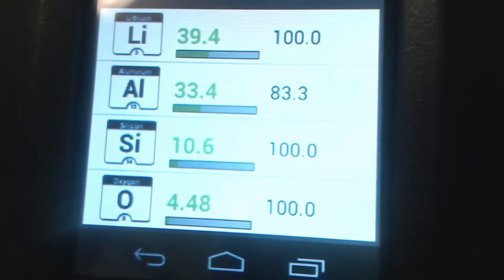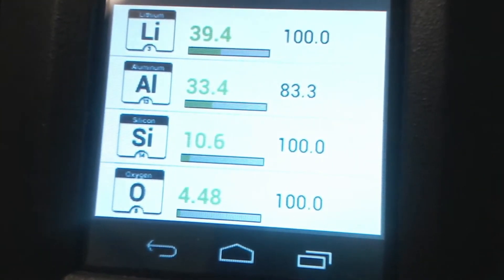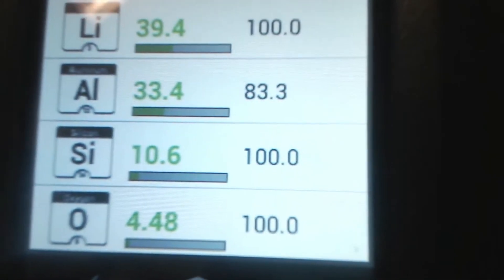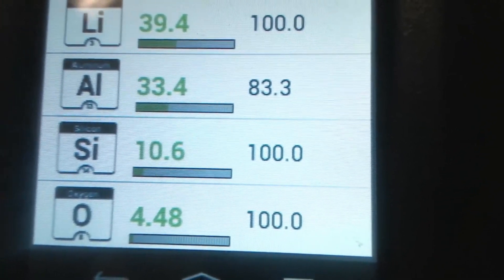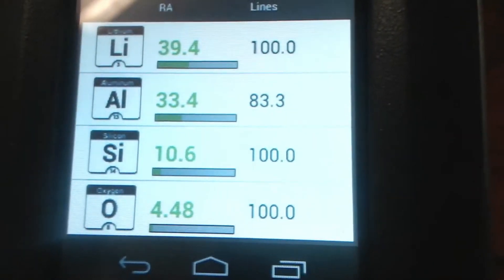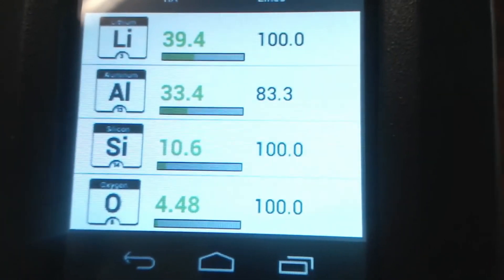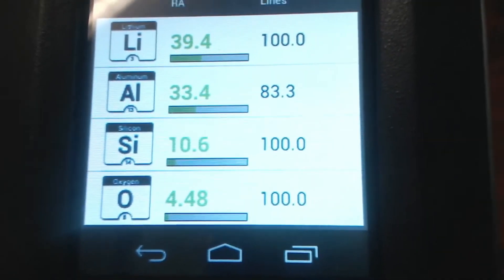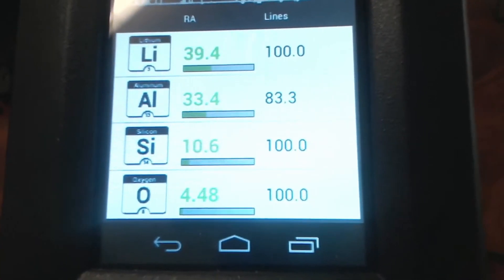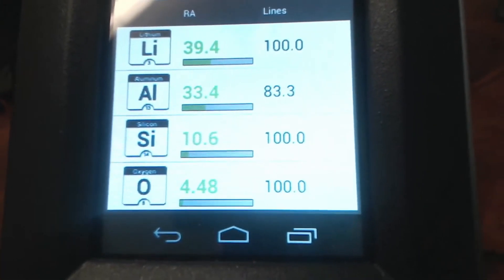This is actually a sample of a mineral called spodumene, which is a high-lithium mineral. It also has a lot of aluminum and silicon, so when we shoot it in this qualitative app called Element Pro, we see lithium, aluminum, and silicon all at the top of the list of elements detected. You also see these green numbers — those are not percentages, we call them relative abundances. They're there to tell you how strong a signal is in the spectrum relative to the other elements, giving you a rough idea if there's a lot or a little.